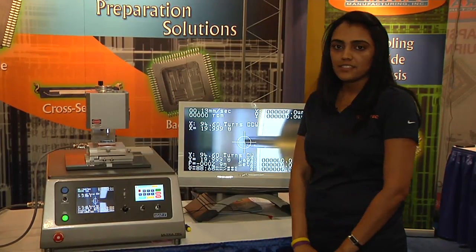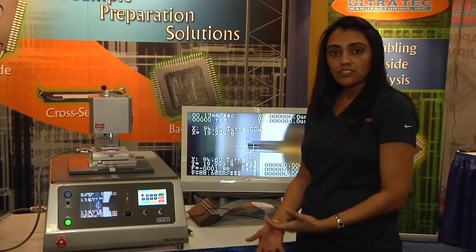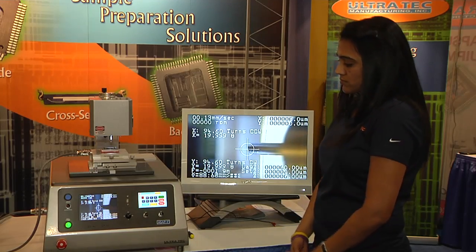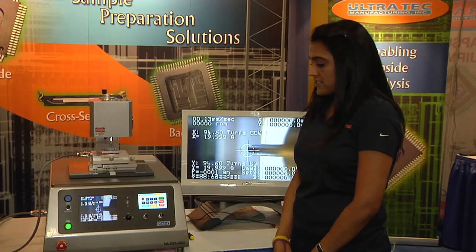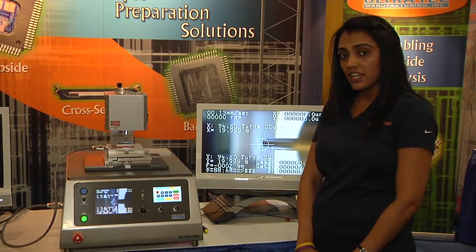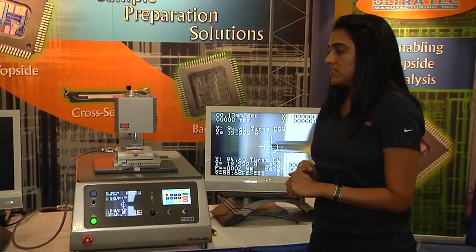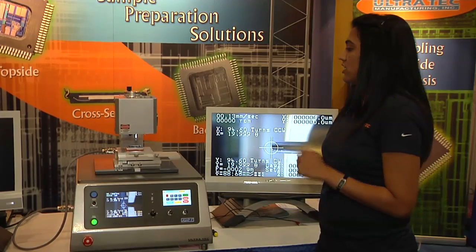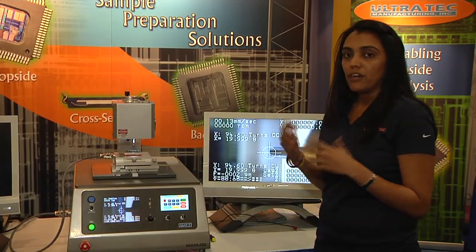ASAP IPS is a digital preparation system to prepare samples of package devices as well as wafer level devices. The IPS has submicron accuracy in the X, Y, and Z axis. Two of the techniques I will be discussing today are the thermal relaxation technique as well as the curvature correction technique, which involves flat planar samples derived from thinning and polishing of samples that are curved or have warpage in them.